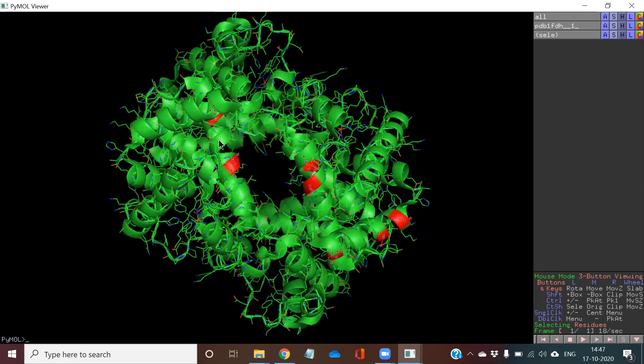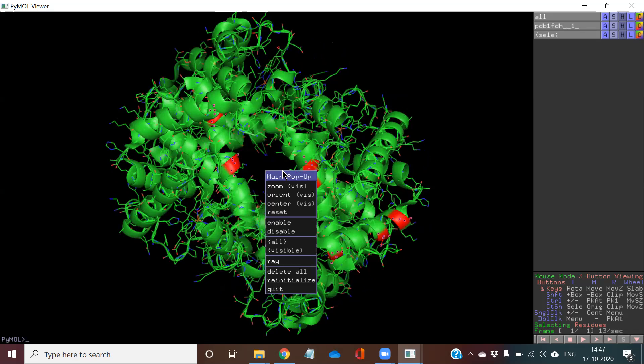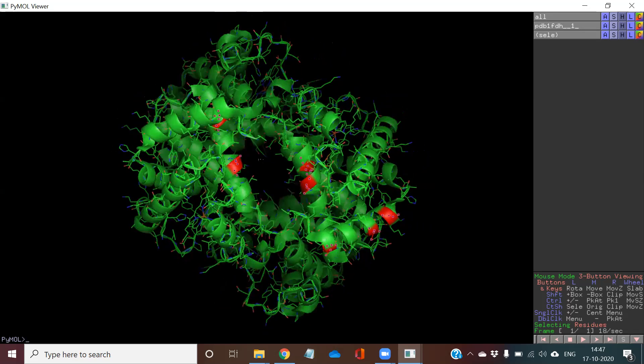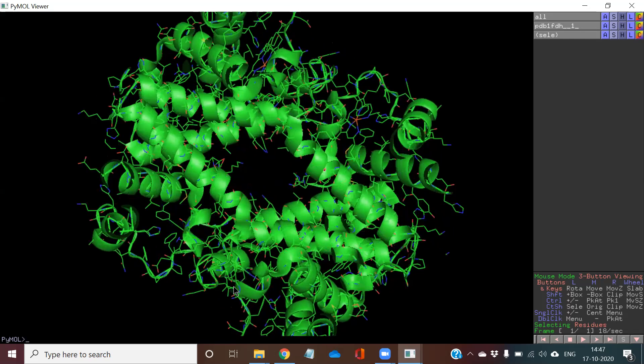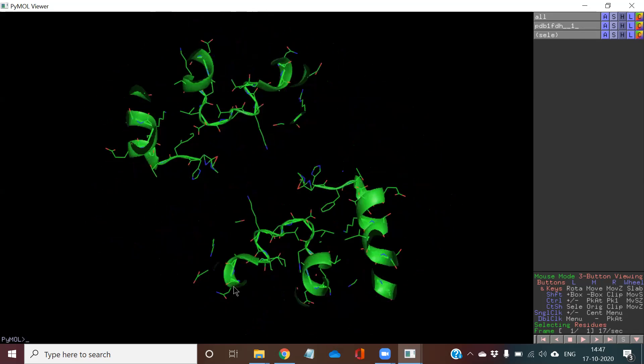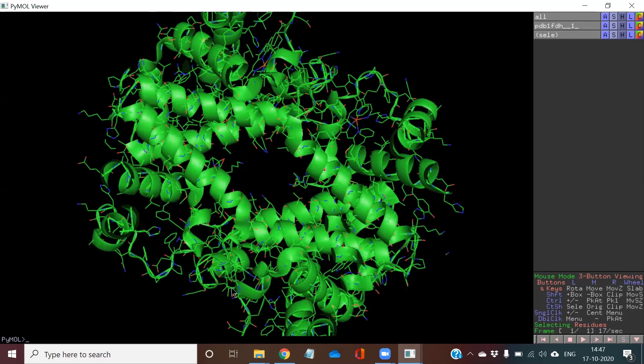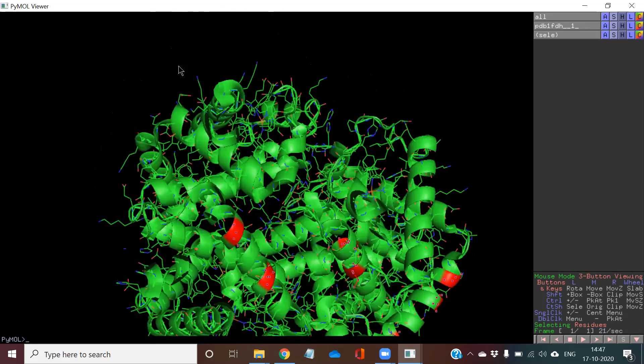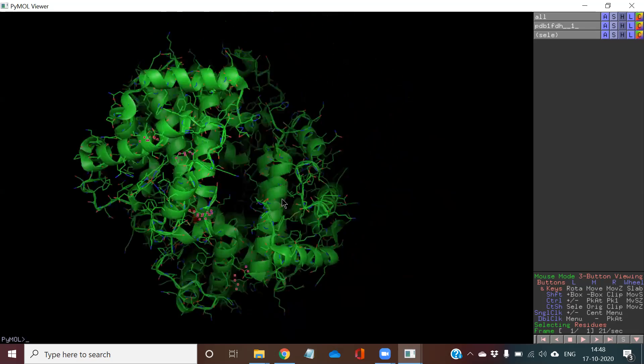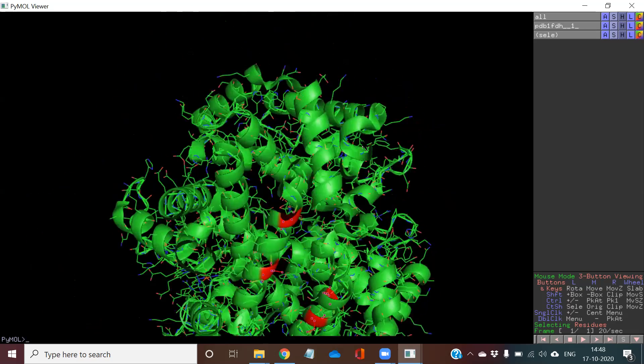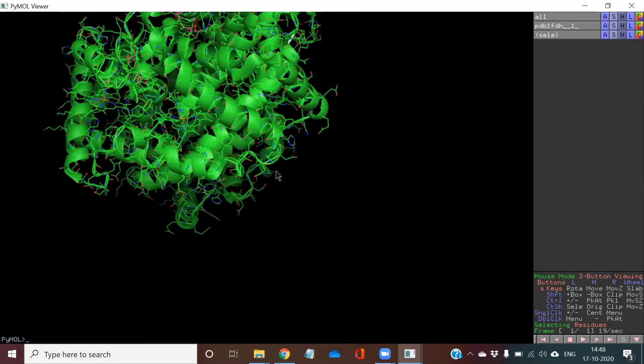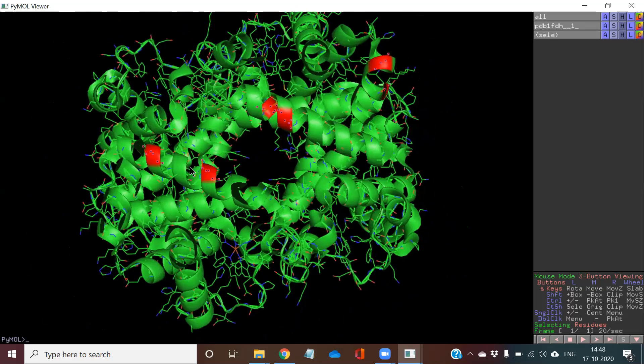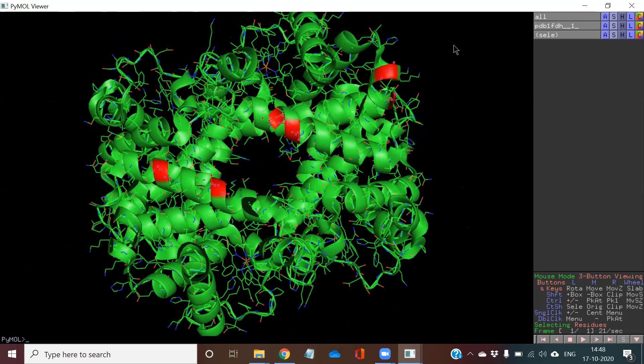Suppose here you can see a pore, so you can zoom on it. The structure can be zoomed out, zoom in. There are various ways of playing with this structure and you can rotate it 180 degree, 360 degree. So different ways you can play with the protein structure in this software which is called as PyMOL.